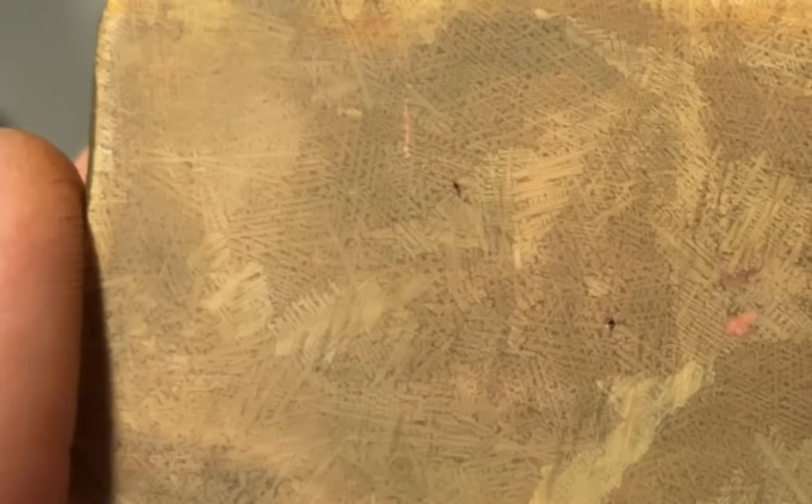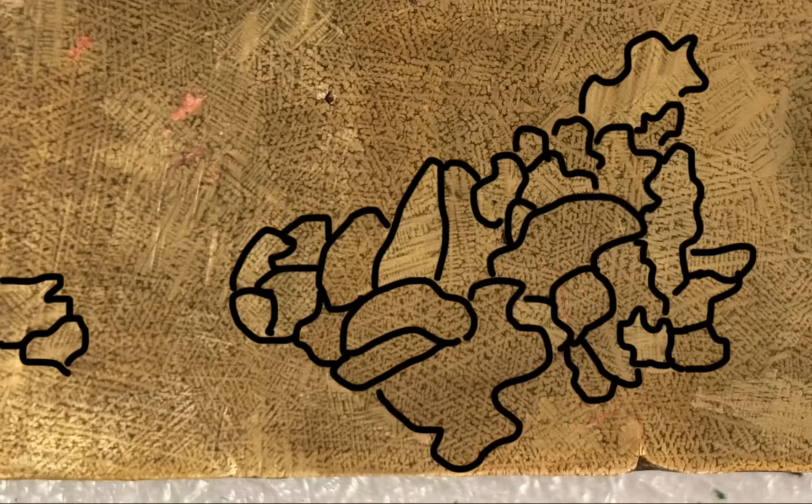Now that the dendritic structure is visible, let's see if there are any differences between the ingots. The air-cooled ingot has relatively small dendrites, but they're very sharp. The contrast between the copper-rich region and the zinc-rich region is pretty much immediate, and there's no blurring between the two. However, the grains are relatively small, being about a centimeter in size.